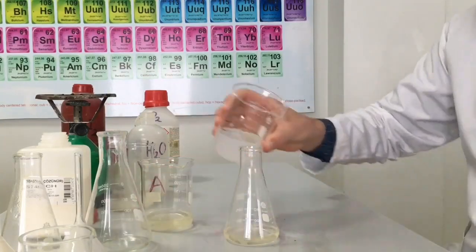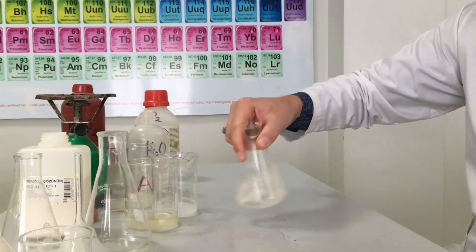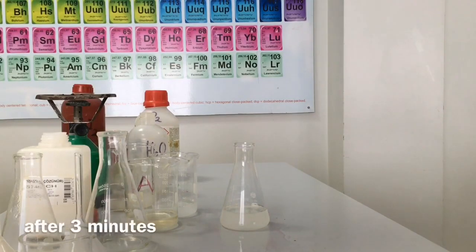Here is the final process: mixing solution A and B. The dark blue color shows the presence of starch and iodine.